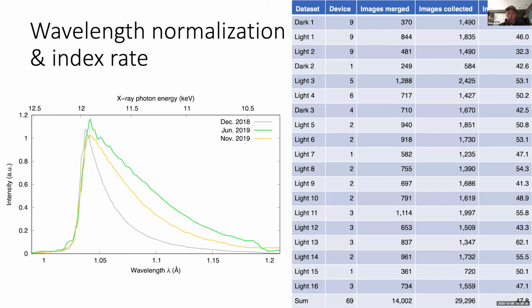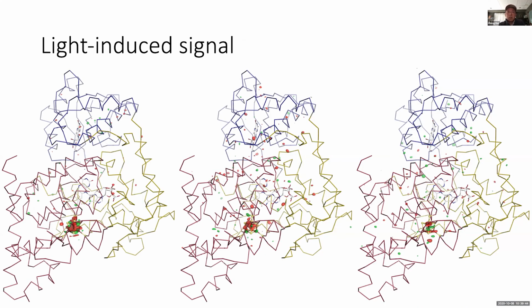And most importantly, you may be interested, well, are they good? Are they good enough to give you signal? All I show you here is this is signal, these are the noise, and then the ratio is the signal to noise ratio. Without getting into the science, it would take too much time to talk about that.